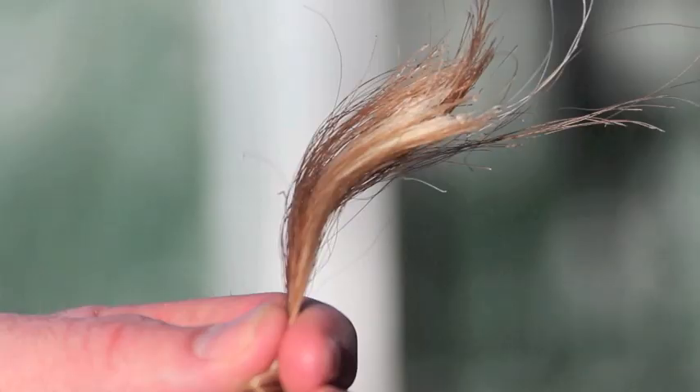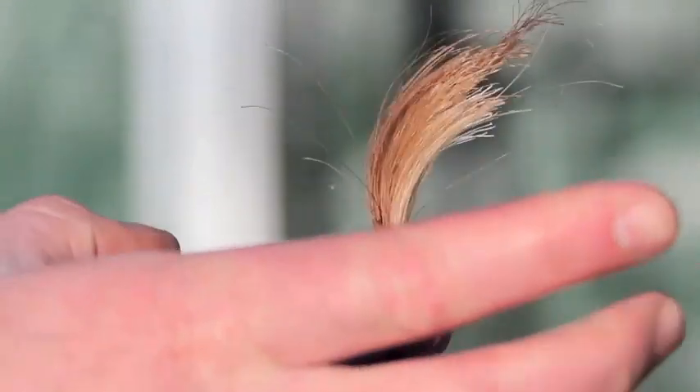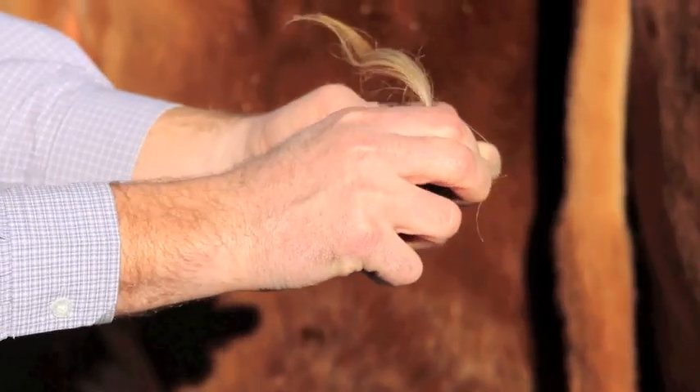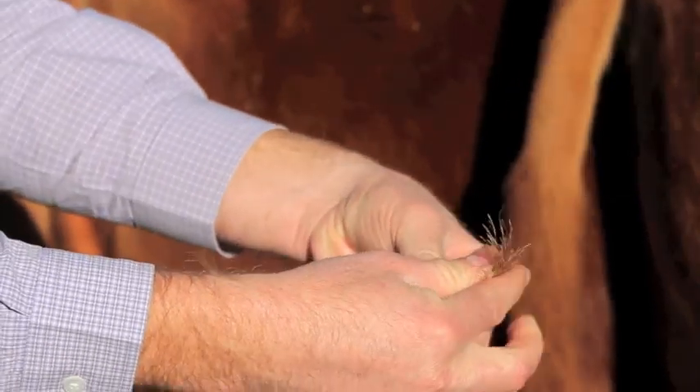When pulling tail hair, the amount needed is about equivalent to the size of your little finger. After the sample has been pulled, you want to flick the hair to remove debris and dander from your sample. After you pull the sample, you want to tie the hair in a knot to ensure that you keep that sample together.